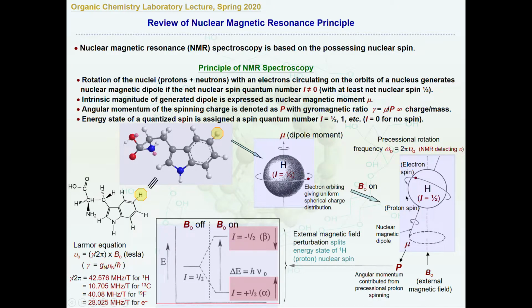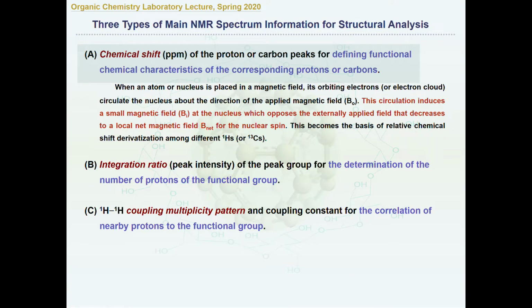Forget about the principle; what you exactly see in the NMR is that with more electron density around it, you will see a more upfield shift or downfield shift, separated from each other, and that separates out each proton. And of course the table will give you a reference for what type of proton is more likely to sit where, and that's why you want to check on it. But at least you know where they come from. More electron density generates more magnetic field, which counters the external magnetic field, to reach the minimum. That's a very simple, very short description of the NMR principle for you to pick up very quickly.